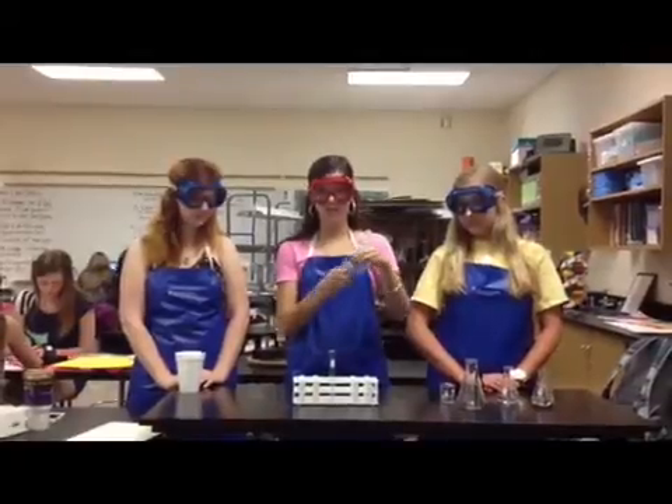Now we're going to test our mystery solution for sugar. We're going to add ten drops of Benedict's reagent and then put it in hot water for two minutes. It doesn't look like there's any reaction because it stayed blue instead of turning yellow. So now we can confirm that this mystery solution only contains starch. Make sure that you clean out all of your test tubes between experiments and good luck on your labs!